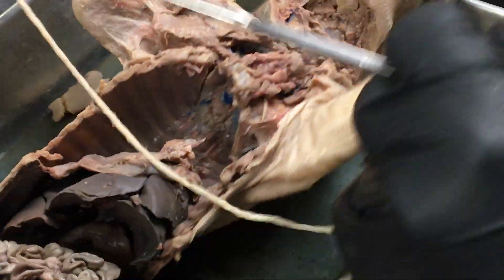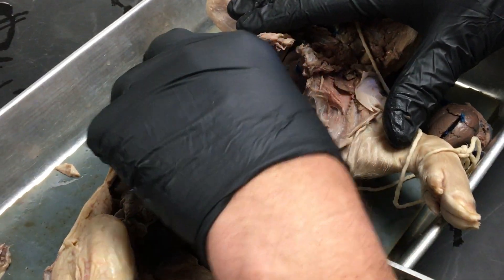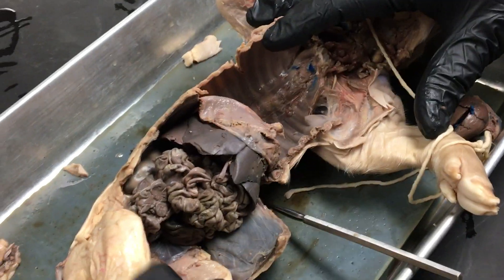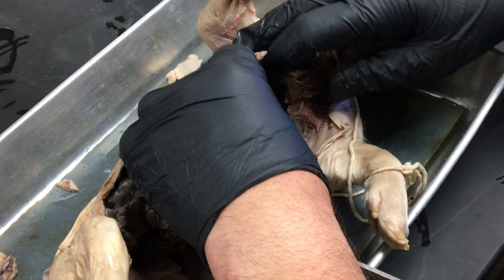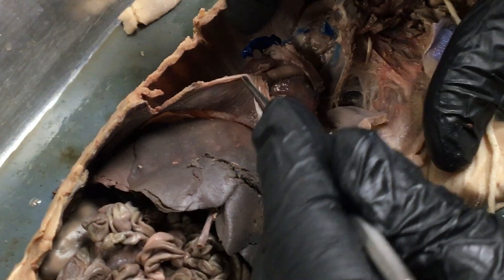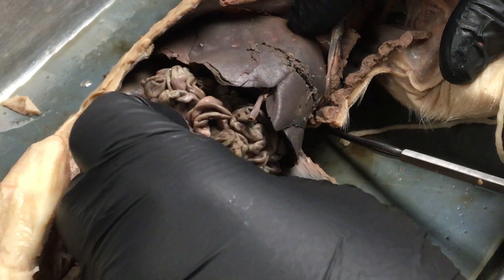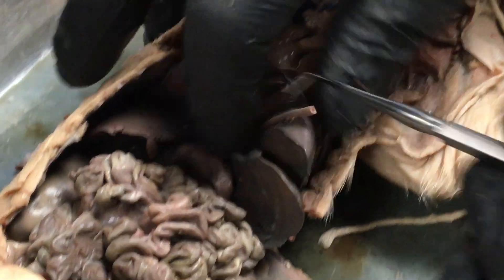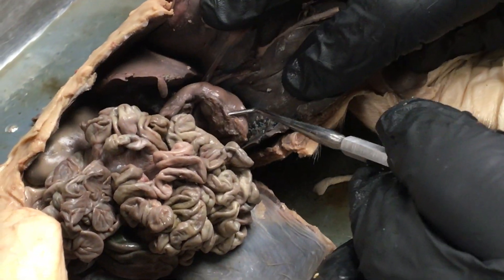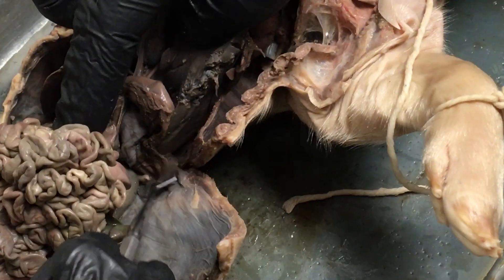Now we'll get into the abdominal cavity. Obviously some organs have been removed — lungs will not be included in this tour because they're gone. Here's our diaphragm right there, and if we lift that up we find the liver. This is the umbilical vein that was originally attached. Underneath the liver we have a gallbladder here. And then here's the stomach right there. Just underneath the stomach we have a flappy thing — this is the spleen right there.